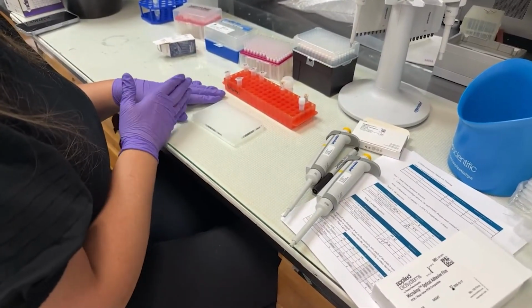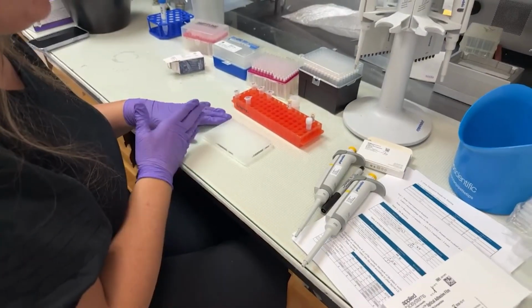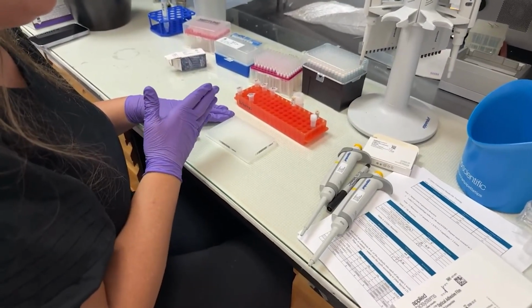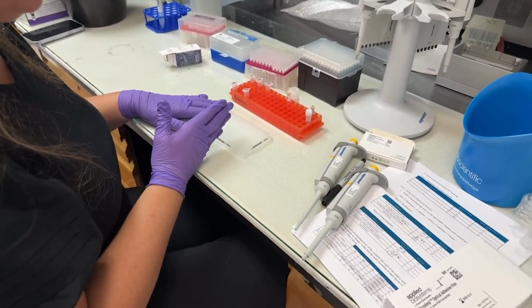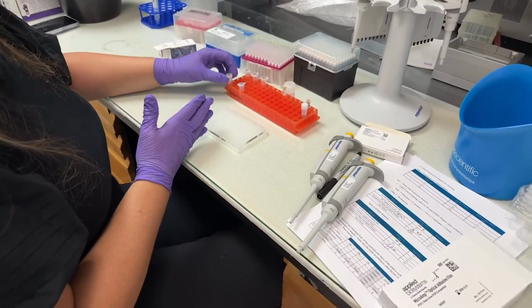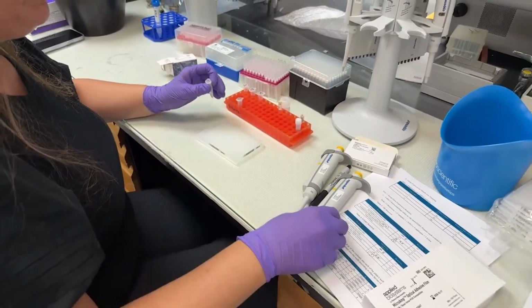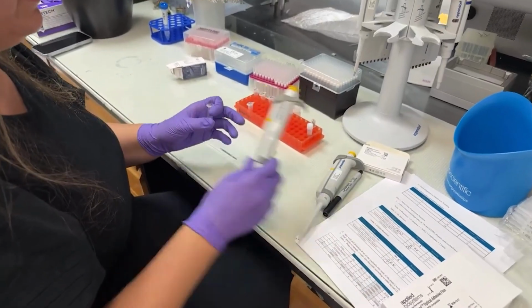So I'm going to put 3, A1, A2, A3, and then C1, C2, C3, and every other one going down. So I'm going to have a column of my 18S in triplicate.